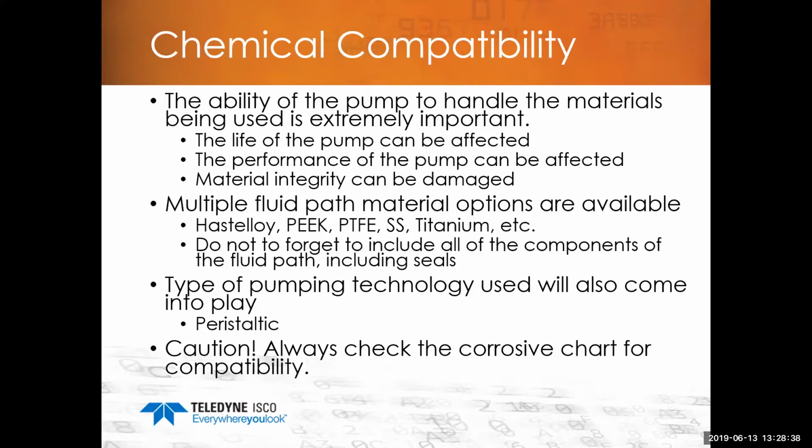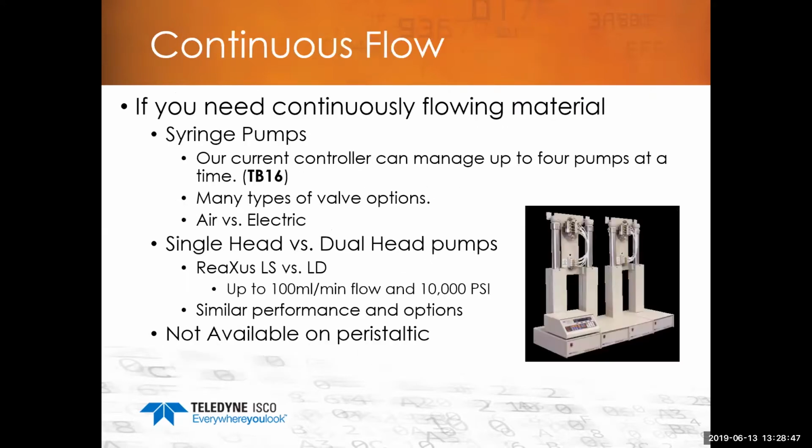Piston pumps, you just have to worry about the head itself. It's a very small flow path, so keep that in mind. If you need continuously flowing material, you can buckle a couple of syringe pumps together to make a dual system. You see a picture there. There's actually 2 dual systems there. And make sure you're considering your valve options and make sure the tubing and the valving and everything else is all compatible with the material.